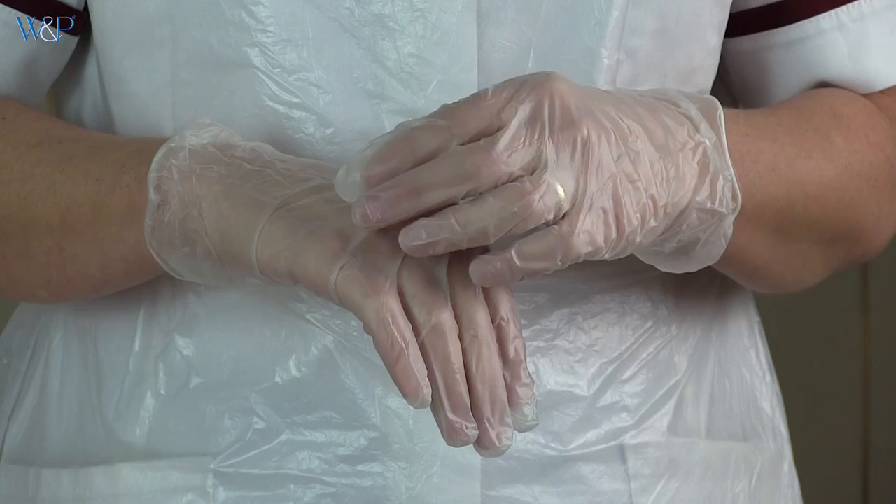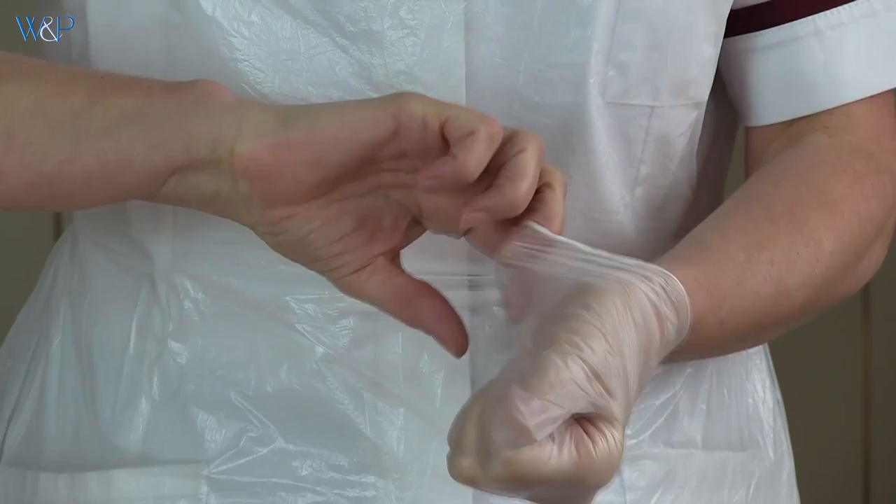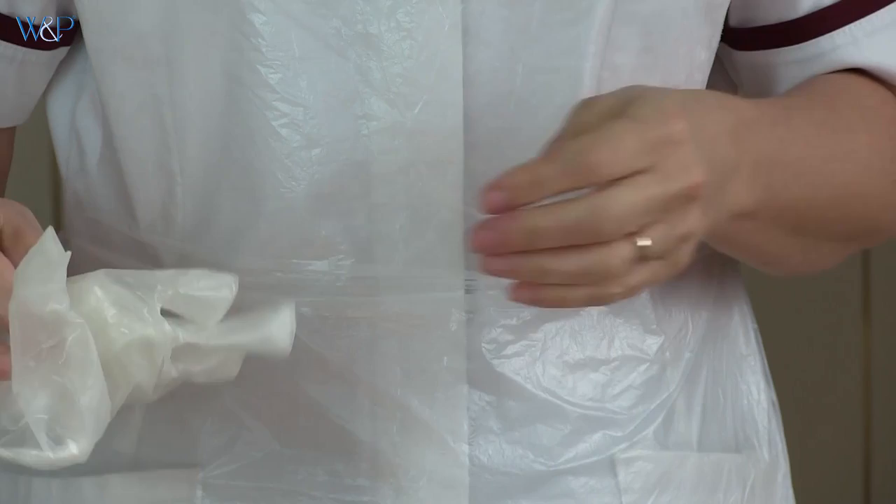For disposal, gloves should be removed first, followed by the apron. Pinch the outside of one glove with your opposite gloved hand and peel off, keeping that glove in the palm of your gloved hand. Slide the fingers of the ungloved hand under the remaining glove at the wrist and peel the second glove off over the first glove.